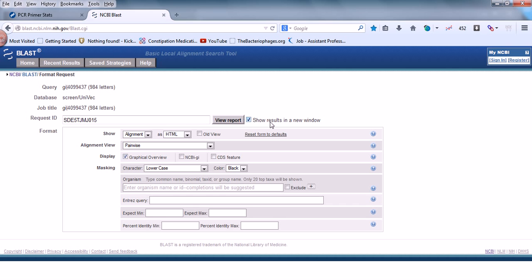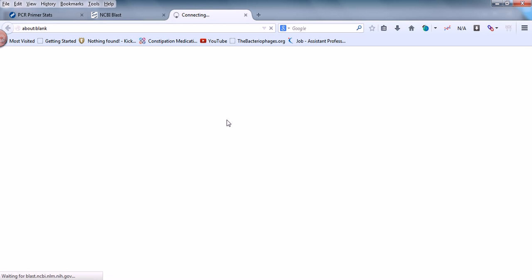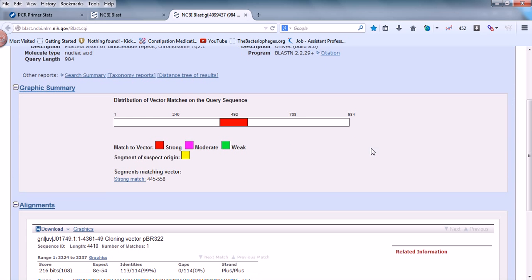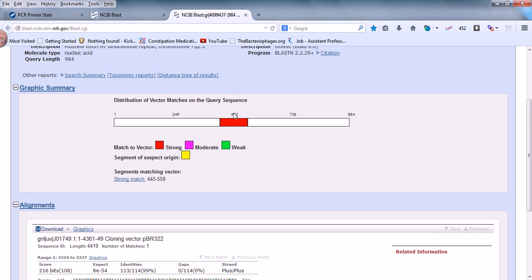Click 'Show results in new window' — it's always good to view results in a new window — then click View Reports. It takes very little time and gives you the results. The description shows Mustela vison GT dinucleotide repeat sequence on chromosome number seven, with a query length of 984.